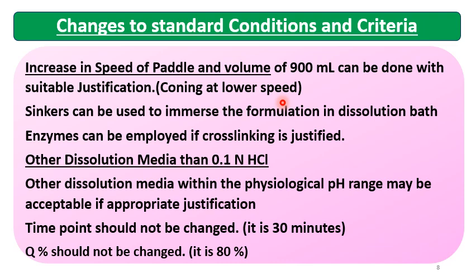Sinkers can be used to immerse the formulation in the dissolution bath, if your tablet or capsule is floating, spinning or dancing in the dissolution medium. Enzymes can be employed if cross-linking is justified with the formulations which contain gelatin, like gelatin coated tablets and gelatin capsules.